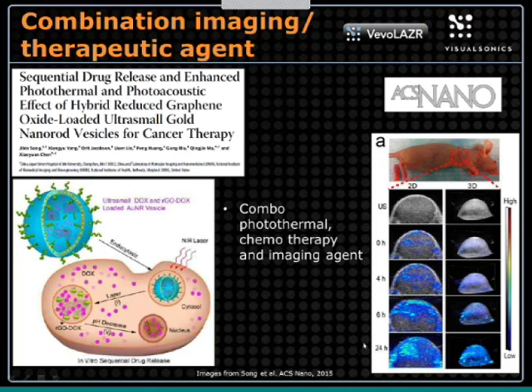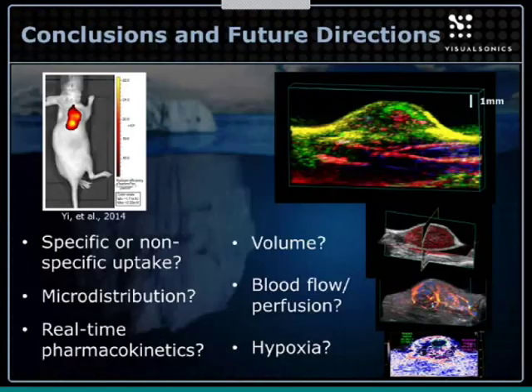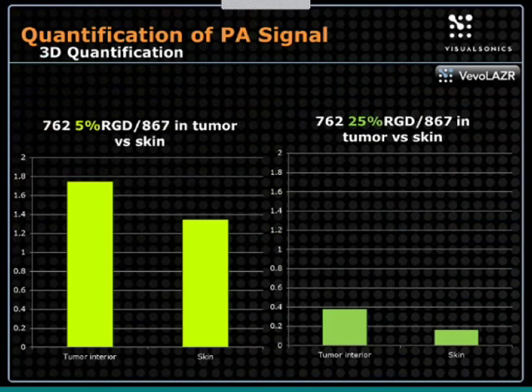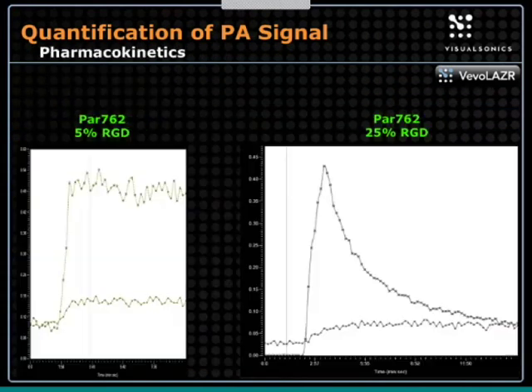There's another question about wanting to get photoacoustic images using nanoparticles. Is animal models the only way? How about excised tissues? A couple of comments on this. In this experiment, I actually did take tissues out. Well, one tissue, the liver. I actually did take the liver out of these animals.